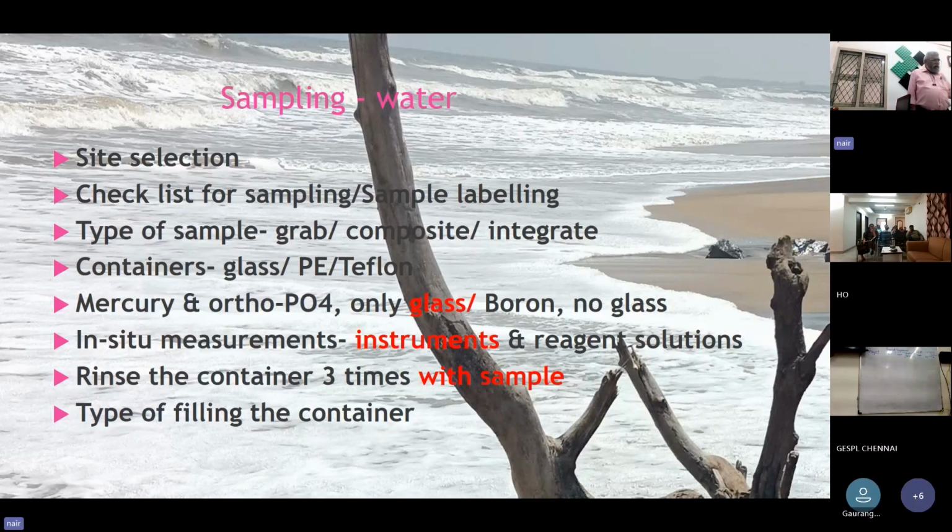See, when functional area experts are going to monitor how the monitoring people are doing the sampling, how this monitoring work is going on, they have to see whether these people have carried the instruments required for sampling and for the in situ measurements. pH can be measured at the site, or if you want conductivity, it can also be measured at site.